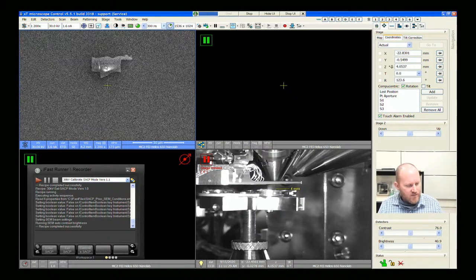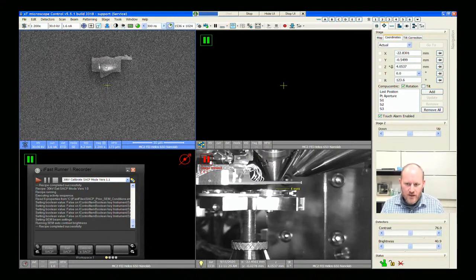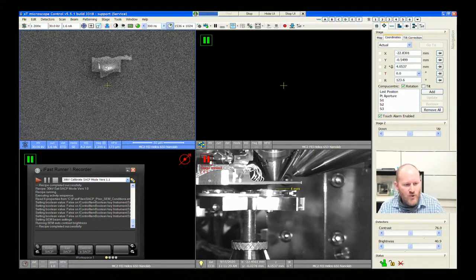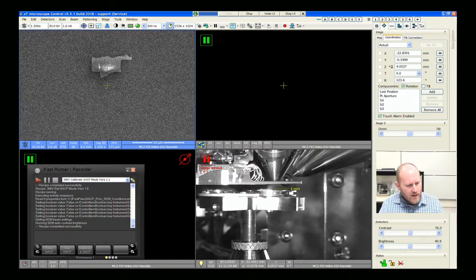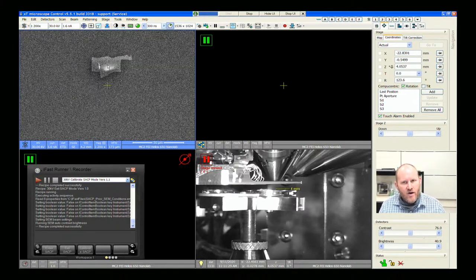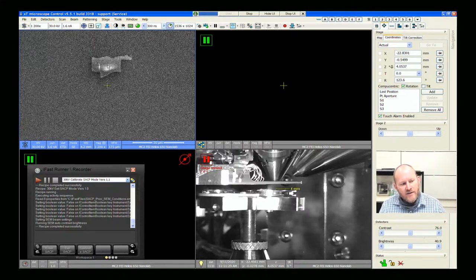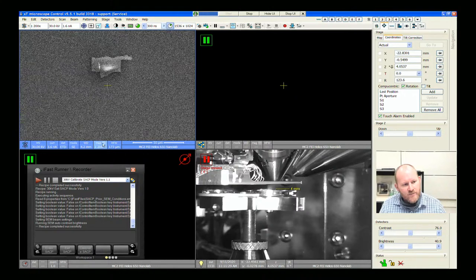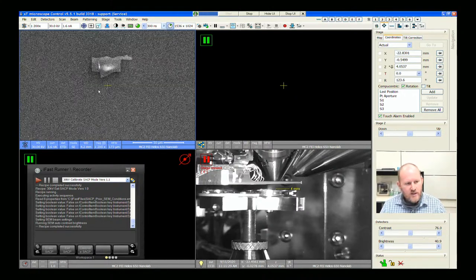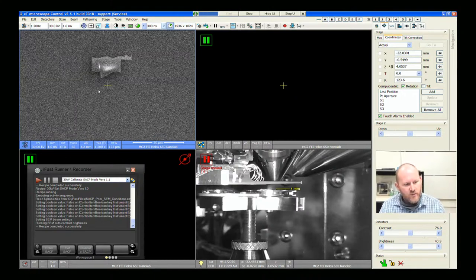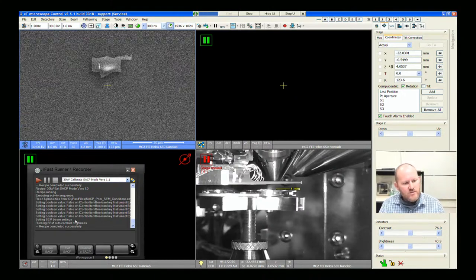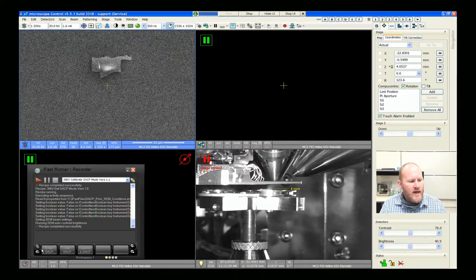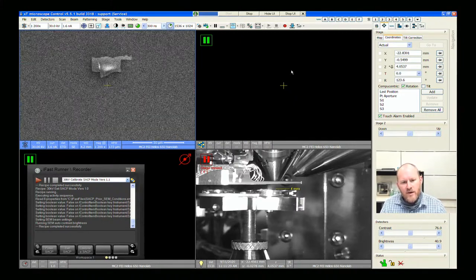One by-product of rocking the beam and being in SACP mode is that the stage movements don't work right, because they are tied to the perceived magnification. So none of my arrow keys or clicking around will help. Usually I like to move around outside of SACP mode, and then we enter SACP mode.